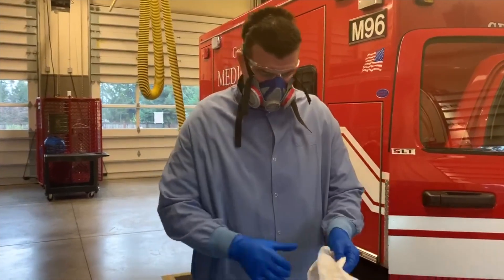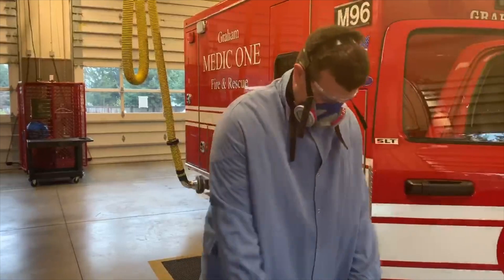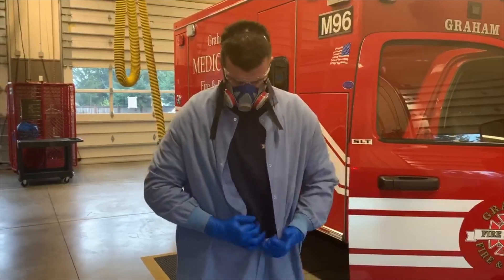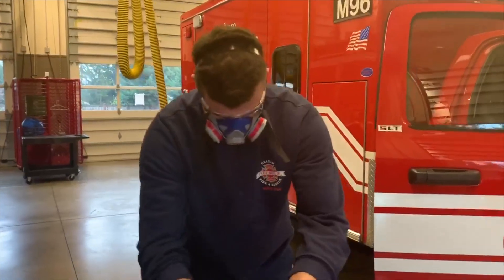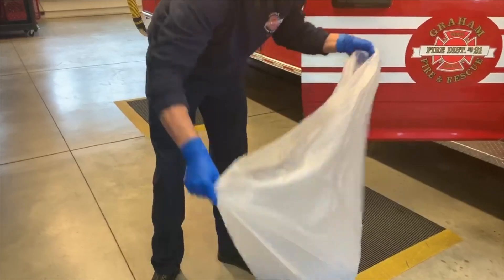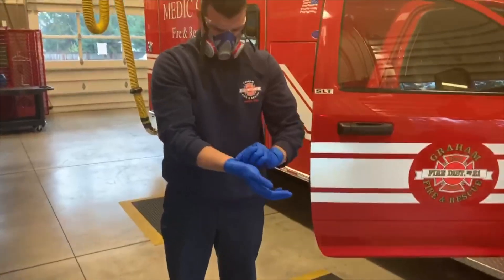When we've completed the call and need to doff our isolation gown, the first thing we're going to do is open a plastic garbage bag, then take the coat off just like we normally would but inside out. Justin will show us exactly how to do this — he's going to unbutton the coat and take it off inside out. Since his pairs of gloves are already dirty, he's going to use his first pair of gloves, throw the coat in the garbage bag, seal the bag up, and then doff his gloves.